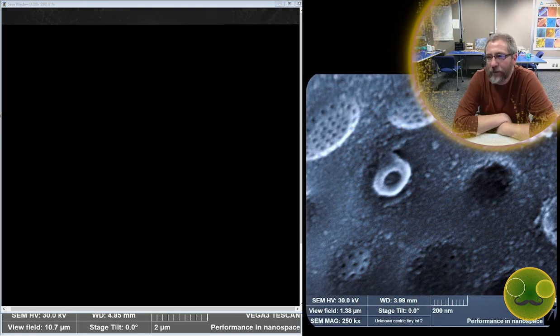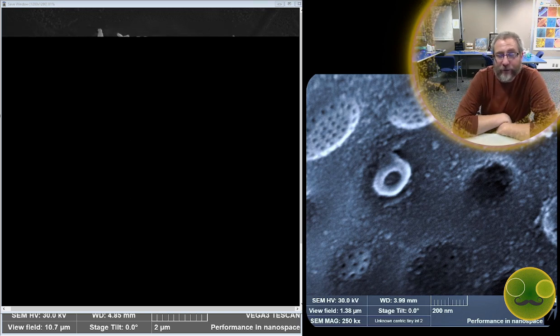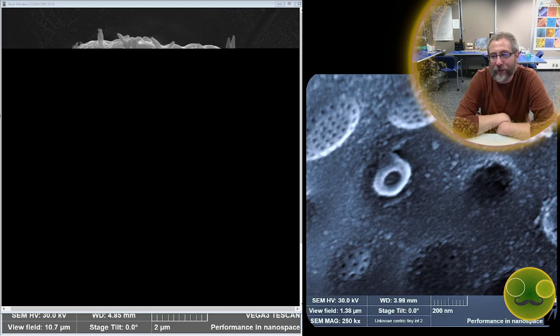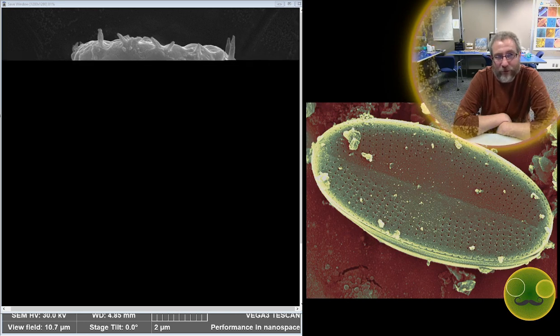Let's see. I've seen them under regular microscopes in undergrad and sadly never used an SEM. Well, Geeky, I'm bringing you your SEM view of them here, but I would say that it's sort of a different world looking at diatoms in the SEM. There's a lot more detail.